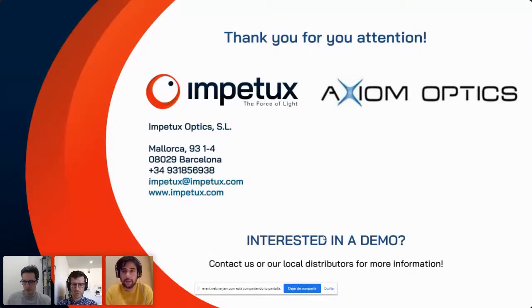Thank you, Oyor and Arno. There was another question from Kaushik. Does this mean that we can only trap cells that are adherent and that are grown on slides? And to which Arno, you answered that, let me see. Your customers usually grow cells on slides or coverslips, but you're not limited to that, right? They could grow them in chambers. They could have them in petri dishes.